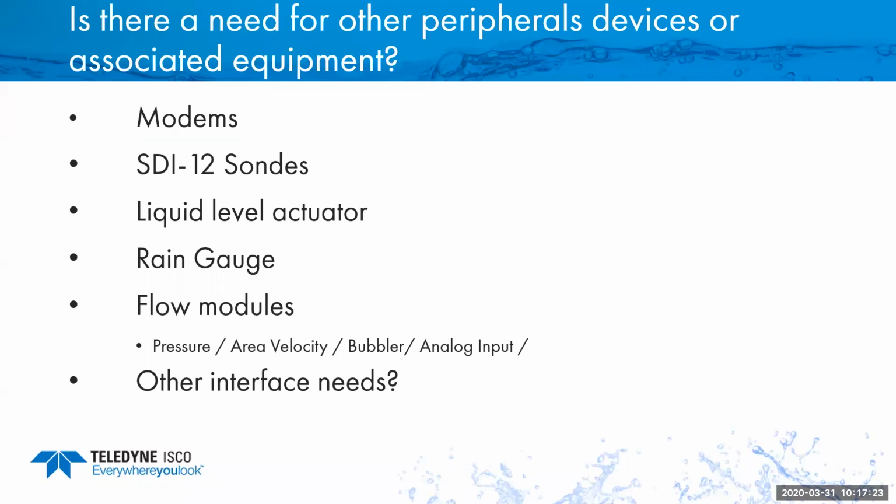Another option is SDI-12 communications. Sondes usually will speak SDI-12. It's just a communication protocol. There are different sondes out there. YSI makes a sonde. The different sondes out there actually read things like pH, dissolved oxygen, turbidity, temperature, conductivity.